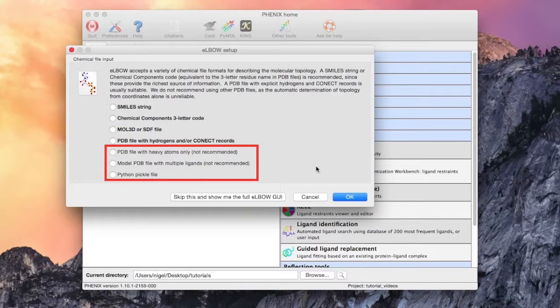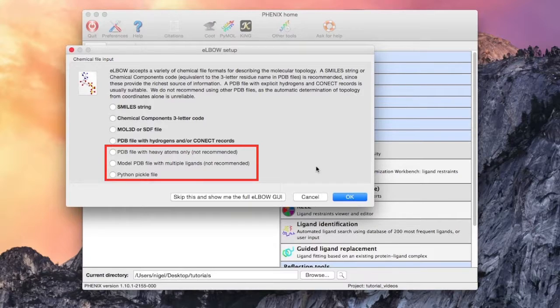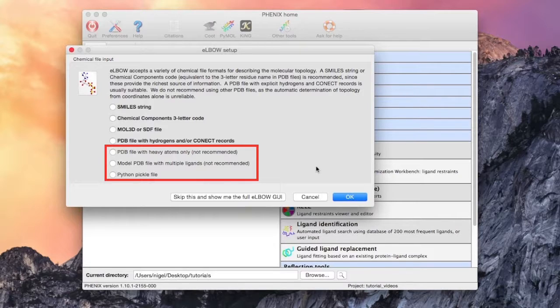The formats at the bottom are not recommended because heuristics are needed to determine the molecular topology and there is room for error. It is always better to know enough about your ligand to use one of the preferred input rather than using the PDB input without connect records or hydrogens.